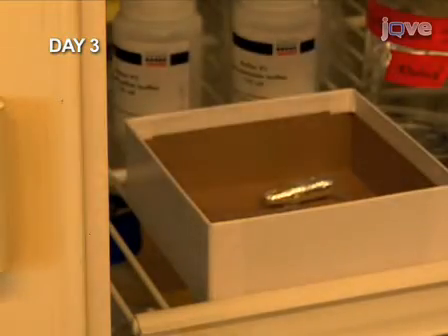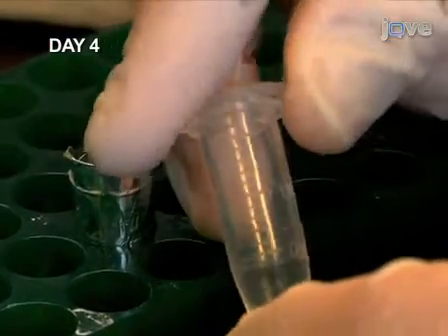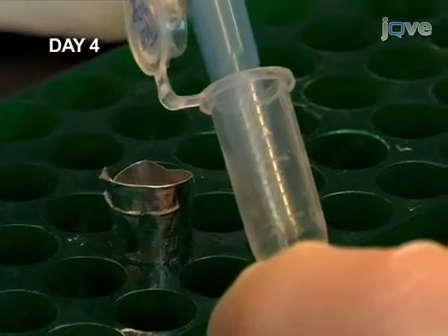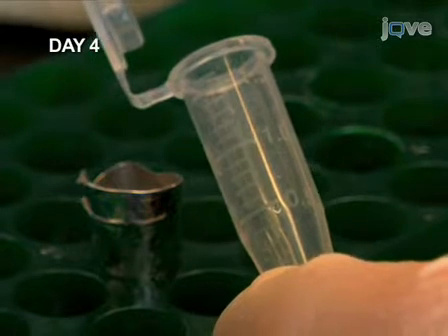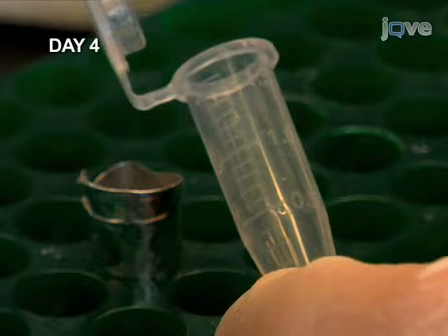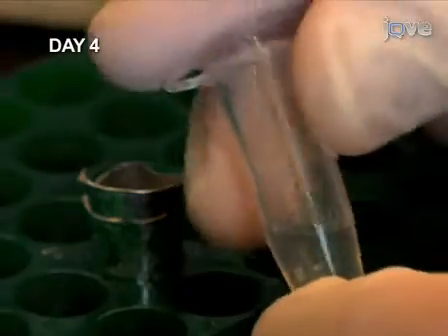Make sure to lay the microcentrifuge tube on its side. Next, start the detection using the tyramide signal amplification system, or TSA. Tyramide is conjugated to a fluorophore. The horseradish peroxidase on the antibody converts the tyramide to a highly reactive intermediate. The reactive tyramide forms a covalent bond to residues in close proximity to the antibody, resulting in localized deposition of the fluorophore.